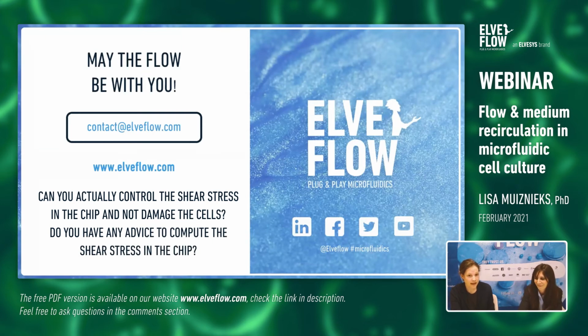Yes, so you can estimate the shear stress inside your chip based on your flow rates using our microfluidic calculator. It's online on our website. The link is also in this presentation, which I believe will be made available for you all to check again. It gives you an idea of what shear stress would be applied to the cells in the chip.